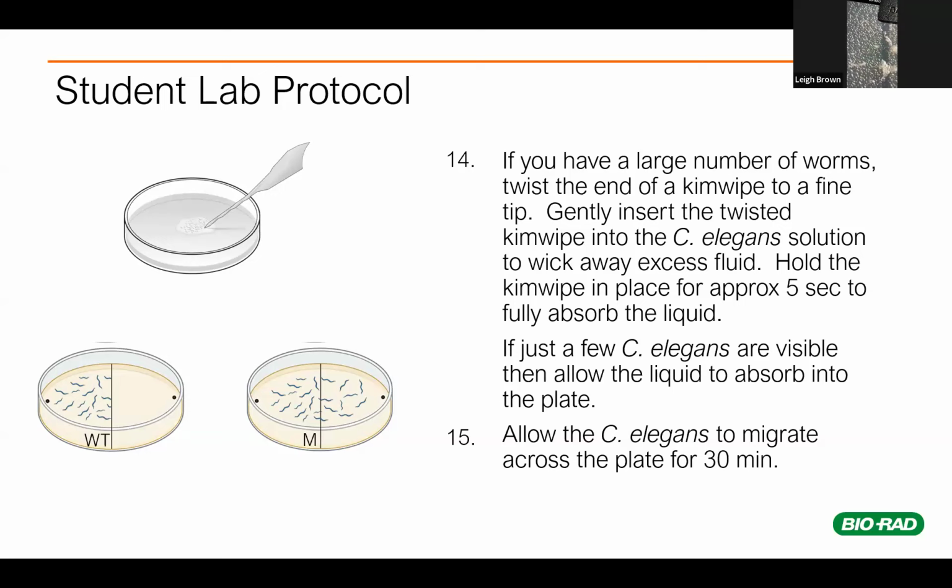All right, Lee, it looks like yours now have contact with the media and are running. Yep, they're going. They're worming. Okay, I'm going to put my video off and I'll come back to this in a little bit. Okay, sounds good. You can take your plates now and just set them to the side. What's going to be happening now is your worms are going to be making those decisions.